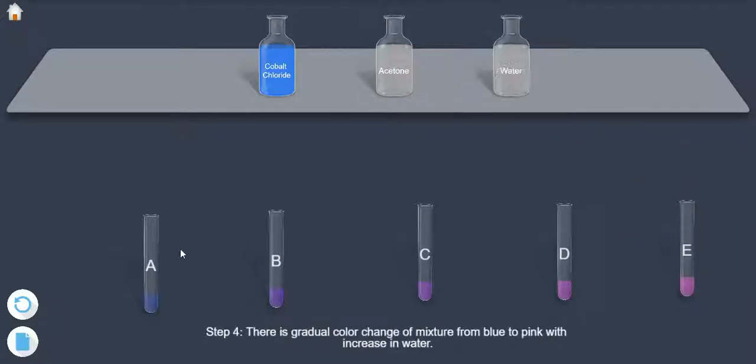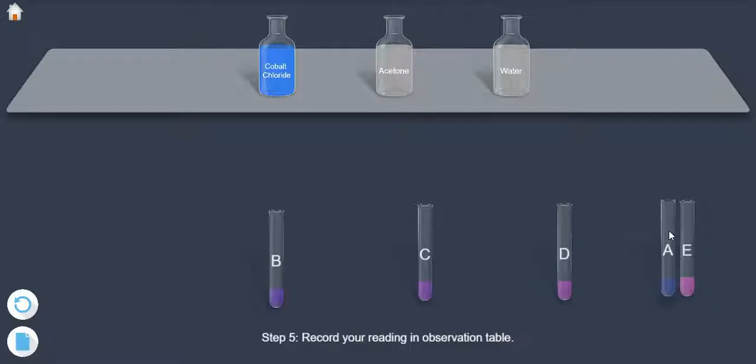There is gradual color change of mixture from blue to pink with increase in water. Record your reading in observation table.